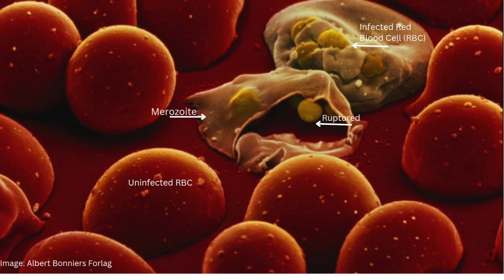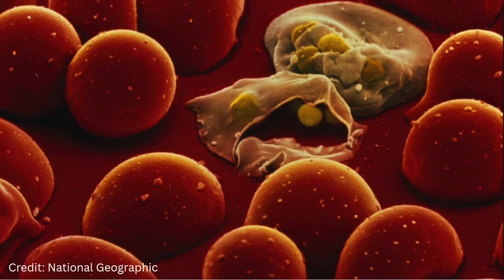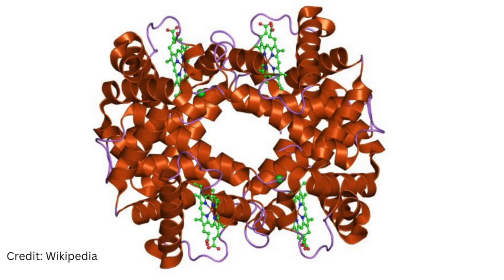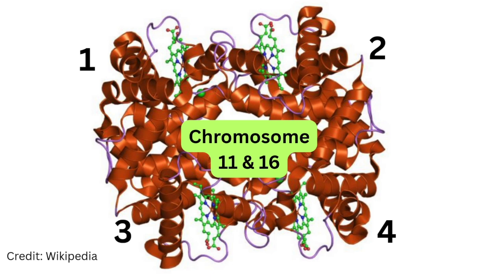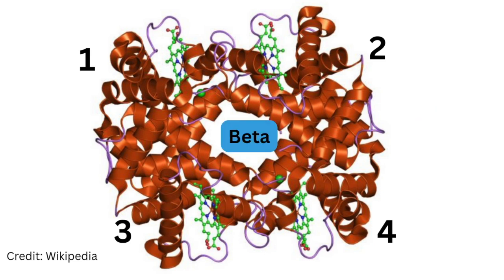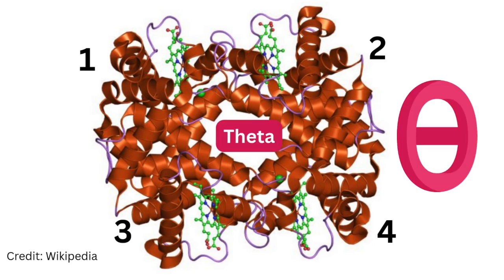As you may recall, red blood cells contain hemoglobin. The globin part is actually 4 globin chains that are joined together to form your globin, which is then paired with your heme. Incidentally, the genes on chromosomes 11 and 16 provide the instructions to create globin. The chains of globin are named by Greek letters. There are 7 Greek letters that are used: alpha, beta, delta, gamma, epsilon, zeta, and theta.